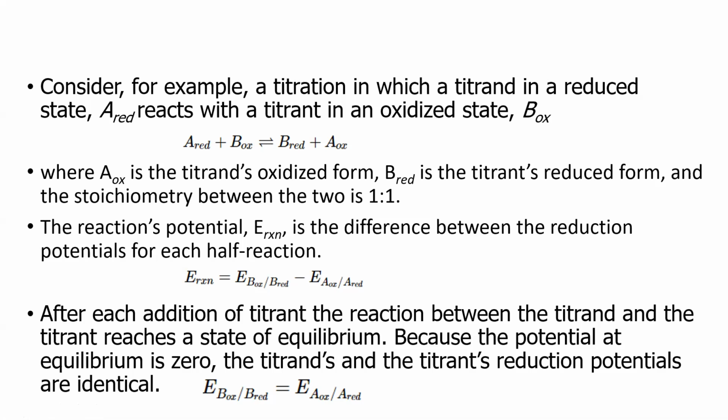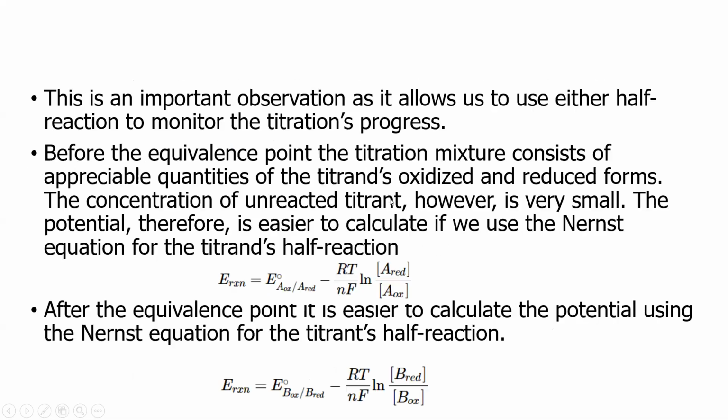That is at equilibrium, provided, remember, that the stoichiometry is 1-to-1. So with this now, we can calculate the potential as the titration progresses.